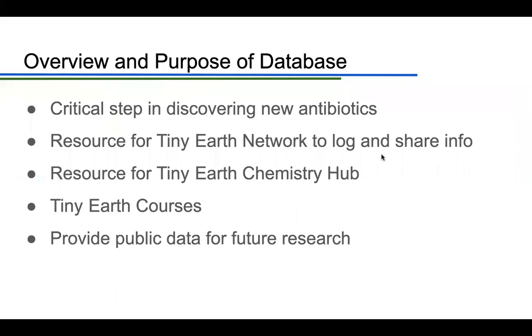The database provides many things to our network. It's a critical step in discovering new antibiotics. With uniform data collection, it allows for comparisons and standardized record keeping across the world. It's a resource for the Tiny Earth network to log in and share information. Data moves to the public database, where you can see and share it. Also, while part of a class, students and instructors can all see the information the class is logging, so you can really use this as a tool in your Tiny Earth courses.